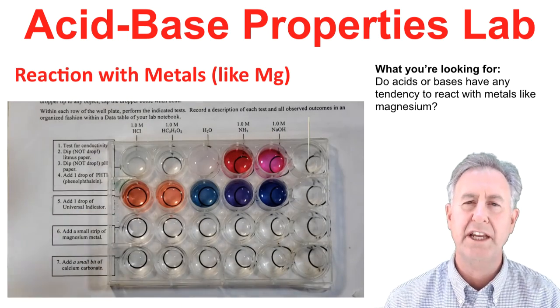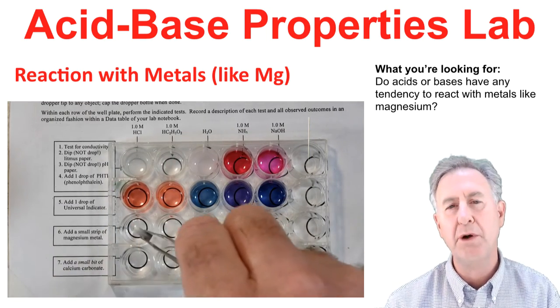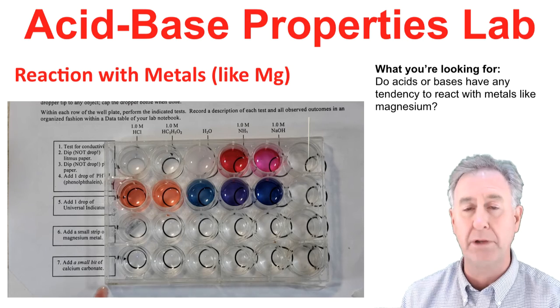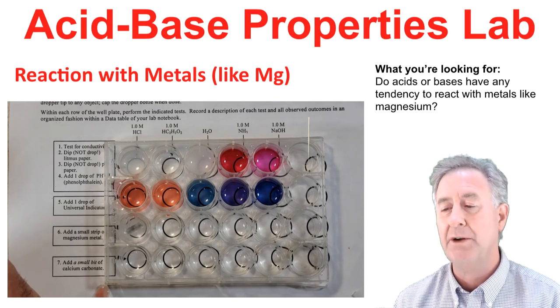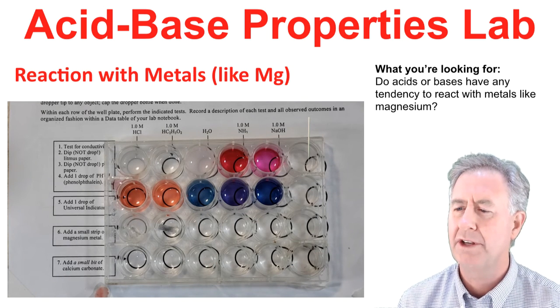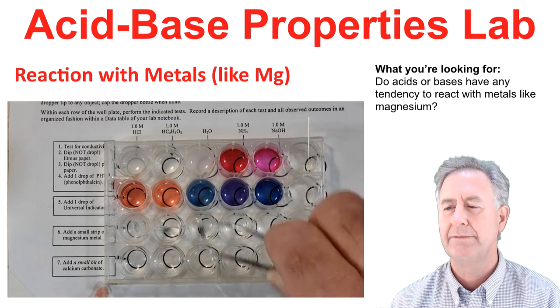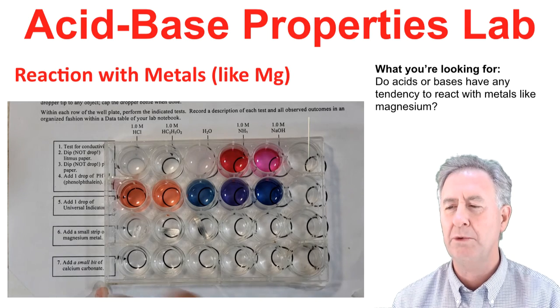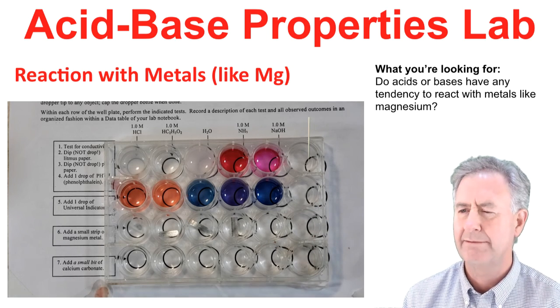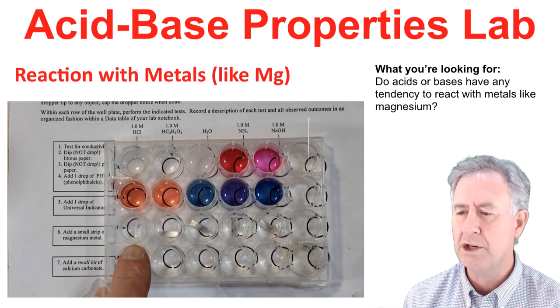Now we're going to run a test to see if acids or bases react with metals such as magnesium. We take a small strip of magnesium and place it in each well. In the first well with strong acid, we notice some bubbling going on. In the weak acid, not so much. In water, no reaction. In ammonia, the weak base, nothing. And finally in NaOH, the strong base, also nothing. Record your observations — there's only one well in which we see a reaction.